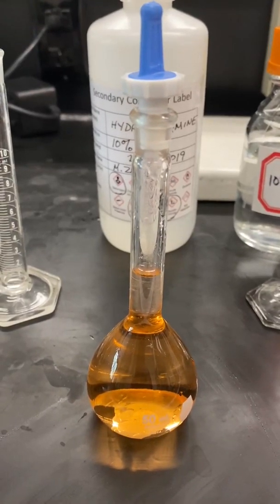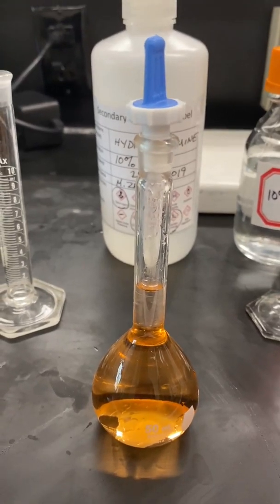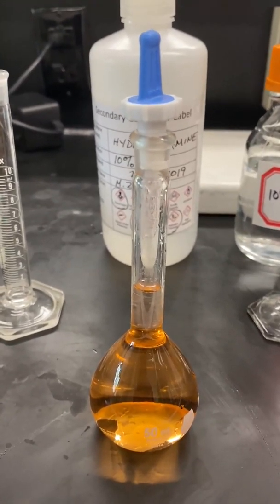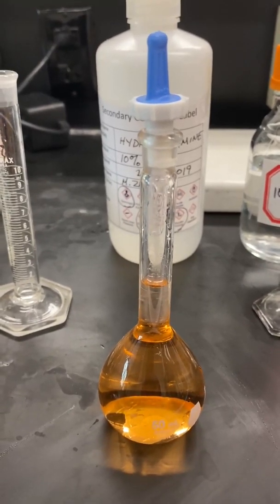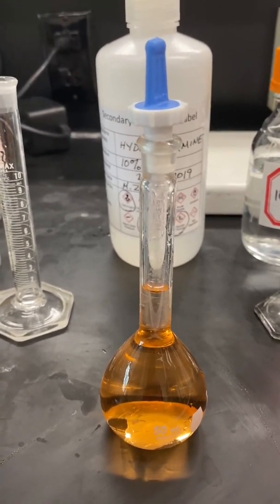Then fill the flask to the mark with distilled water, cap, and mix well. This will be your unknown solution. Transfer this to a test tube labeled the unknown test tube.